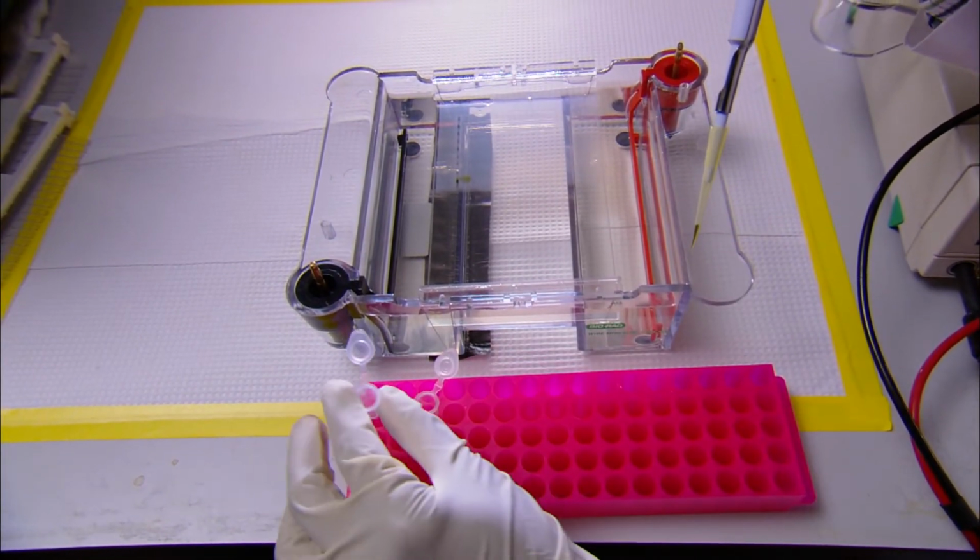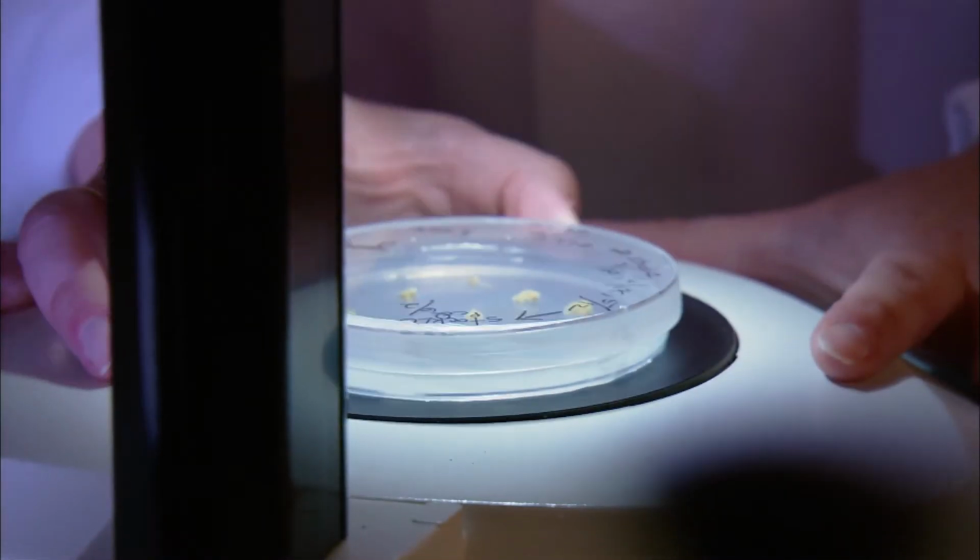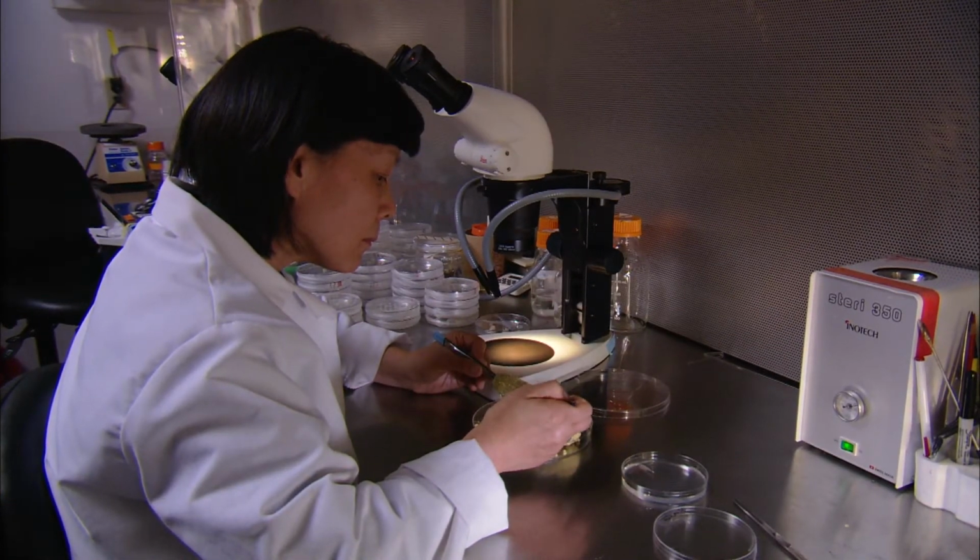Oh, okay. So what's a device like this mean for Stine Seed Company? What are the benefits of having this technology, which is our own transformation technology? I think the main benefit, David, is it gives us freedom to operate. And it gives us unique capabilities to work with other traits that maybe nobody else is working with. So you can work with genes that you've discovered in your own lab, or you can also work with other companies who have a trait of interest that they want to get into genetics.